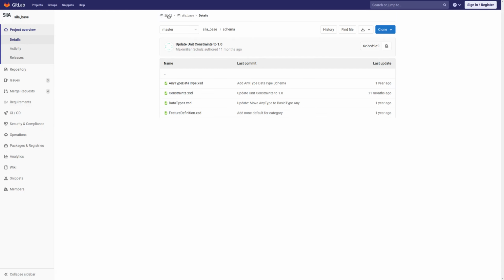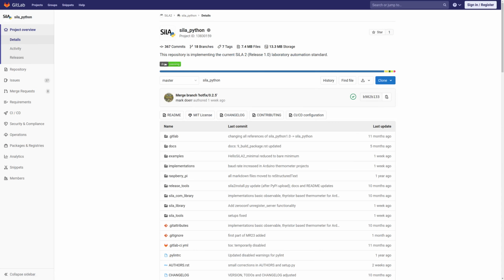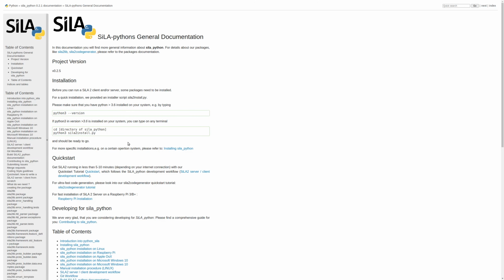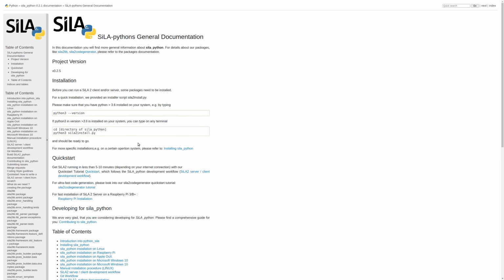If you go to the SiLA Python repository, I'll quickly show where you find this. So here is a docs link, and if you follow that, then we have this classical Python documentation with a lot of information about the API and installation and tutorials. So please have a look there if you have questions.